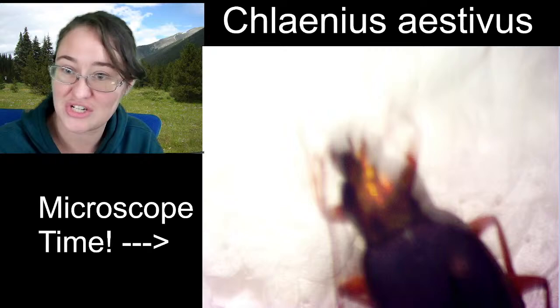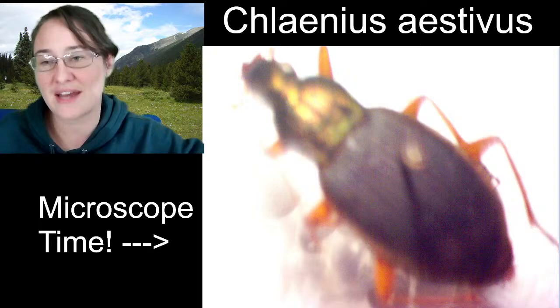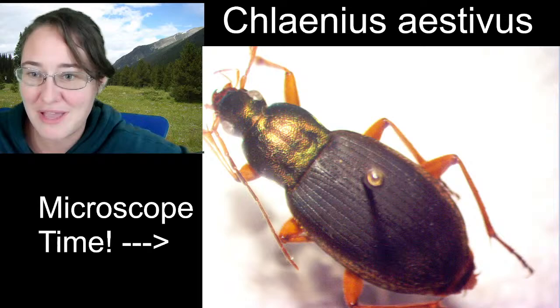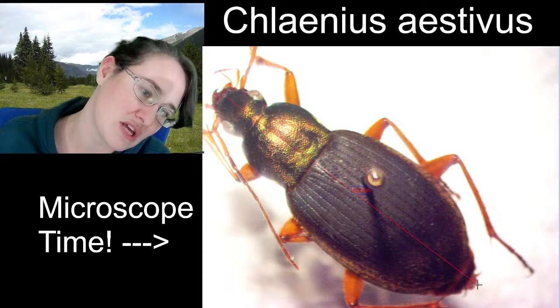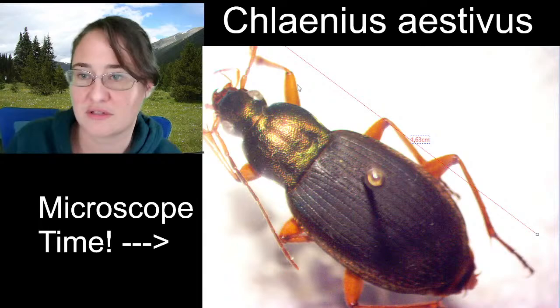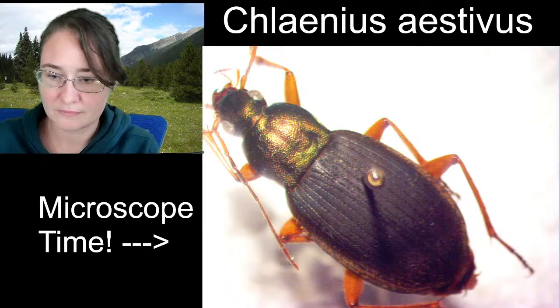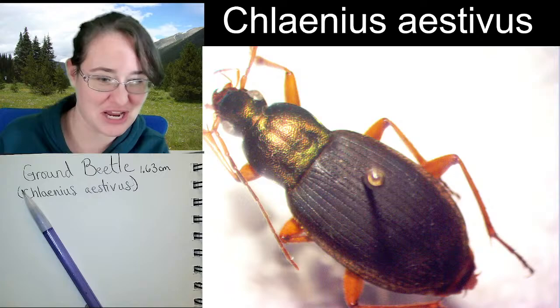With this beetle, at an angle, I can see the entire beetle under one microscope view, so I can use the microscope to measure the length. From the front of the head — not including the mouth parts — to the back of the abdomen, this specimen is 1.63 centimeters long. I think they have that sort of generic beetle shape that I think of when I think of a beetle.